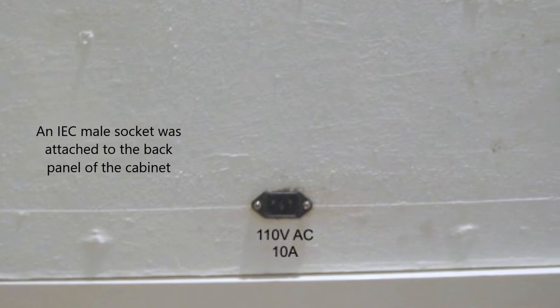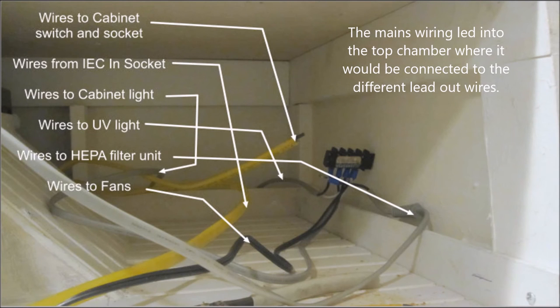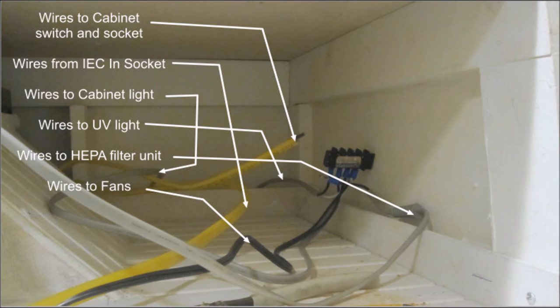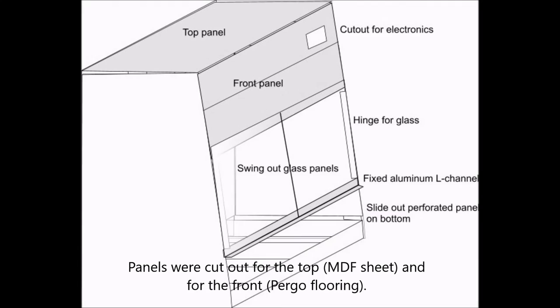Once that was done, I attached an AC inlet on the back of the unit. I'm showing the inside view — the wire led through the back panel, behind the Pergo panels. The wiring shows connections from the switch wire plus a few additional wires. The yellow wires are shown in a bit more detail — you'll have to pause the video to figure out the wiring, as I won't walk through it in too much detail since what you're doing might be substantially different.